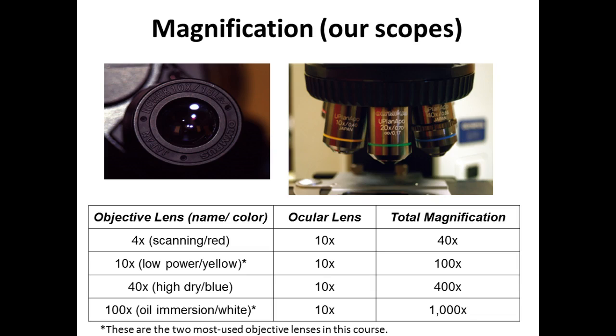When we get done with our microscopes, which we will be using oil all the time when we work with bacteria, you have to put the oil to be able to get the oil objective lens to come into focus, because you'll notice it's very close to the slide. And most of the light will get refracted as it moves through air because its speed changes.